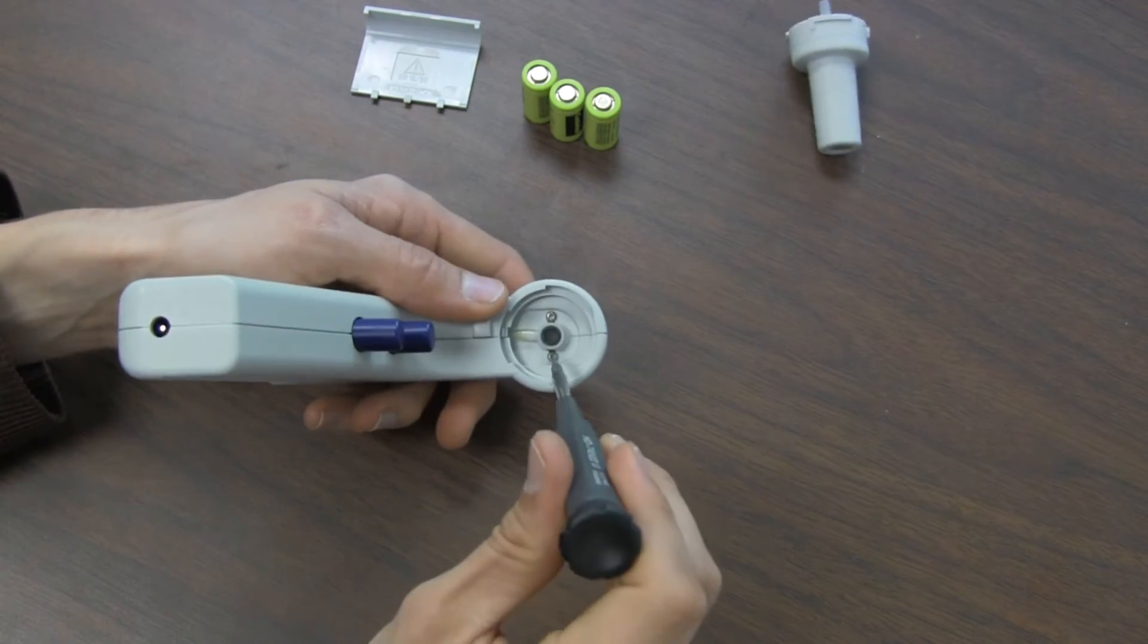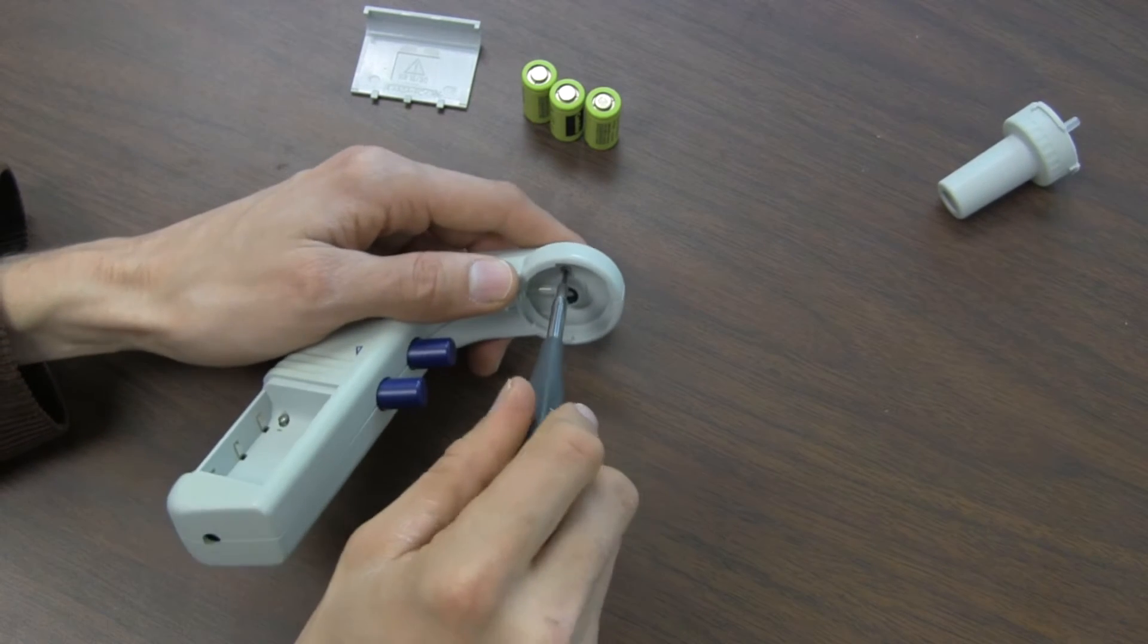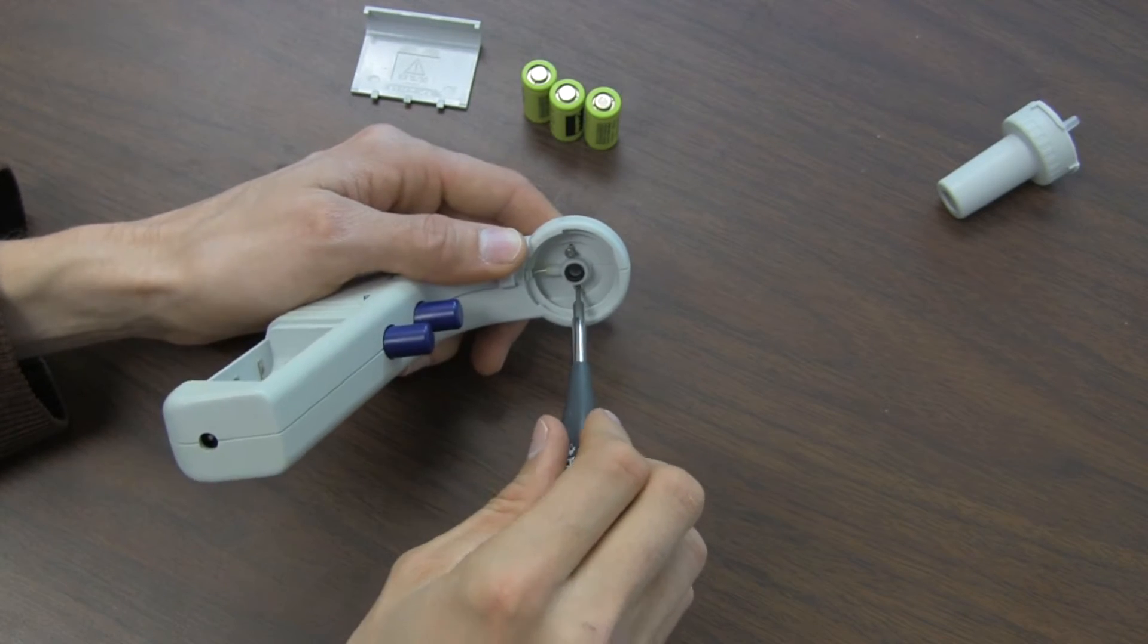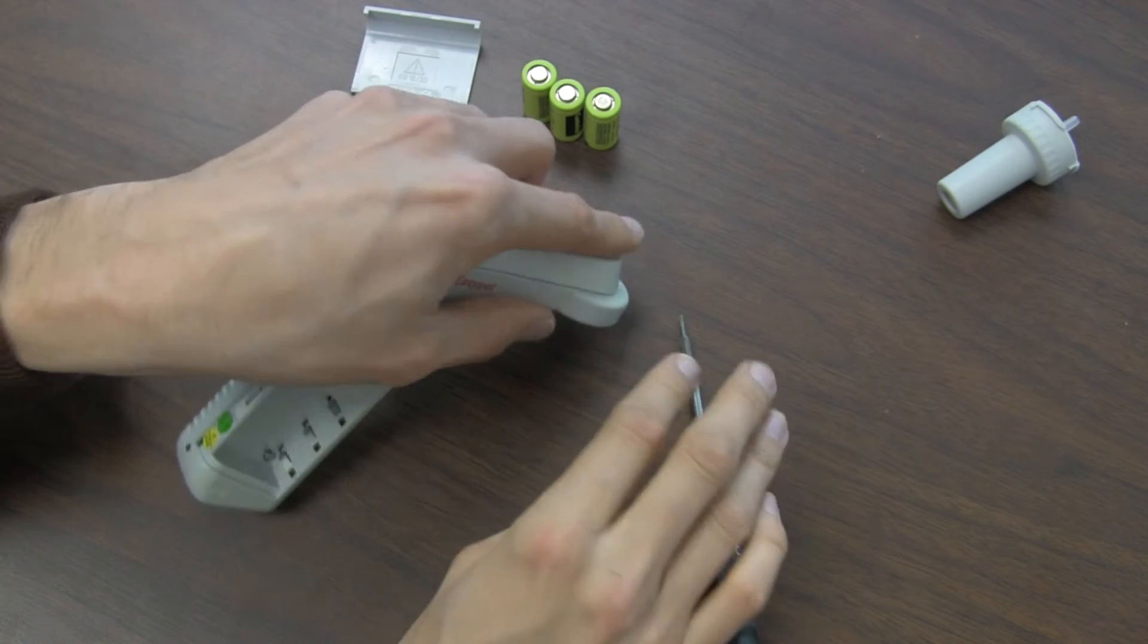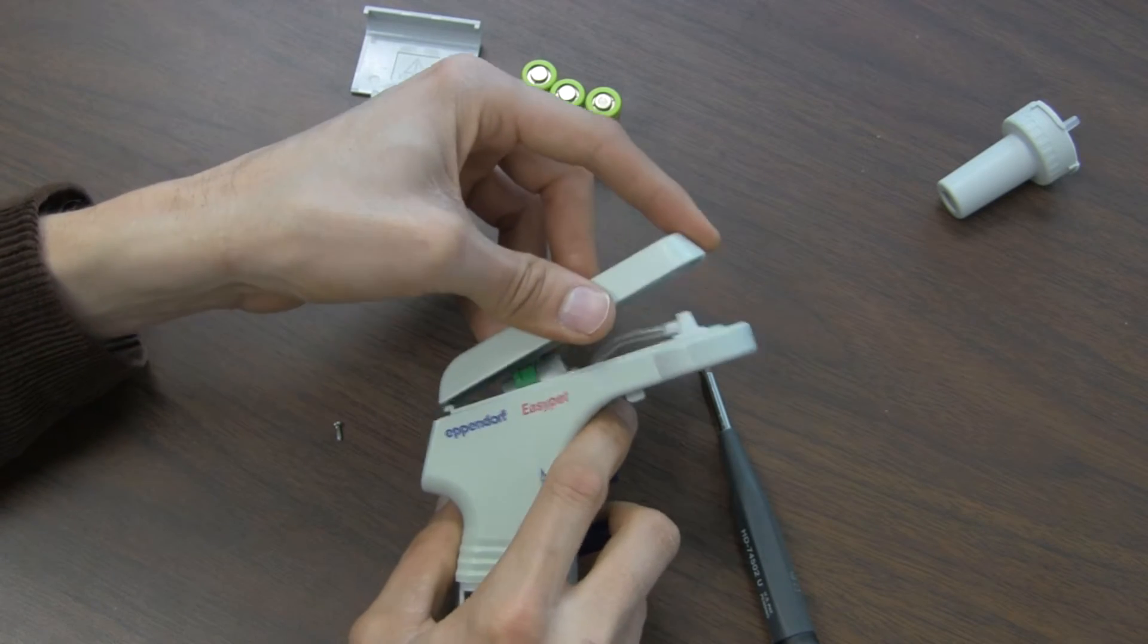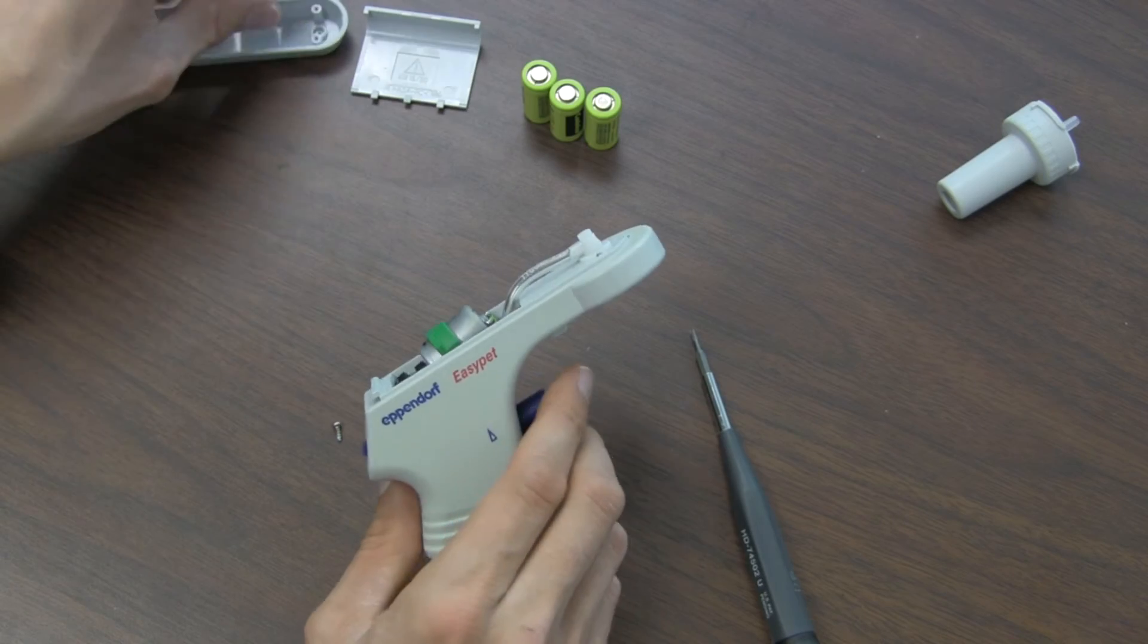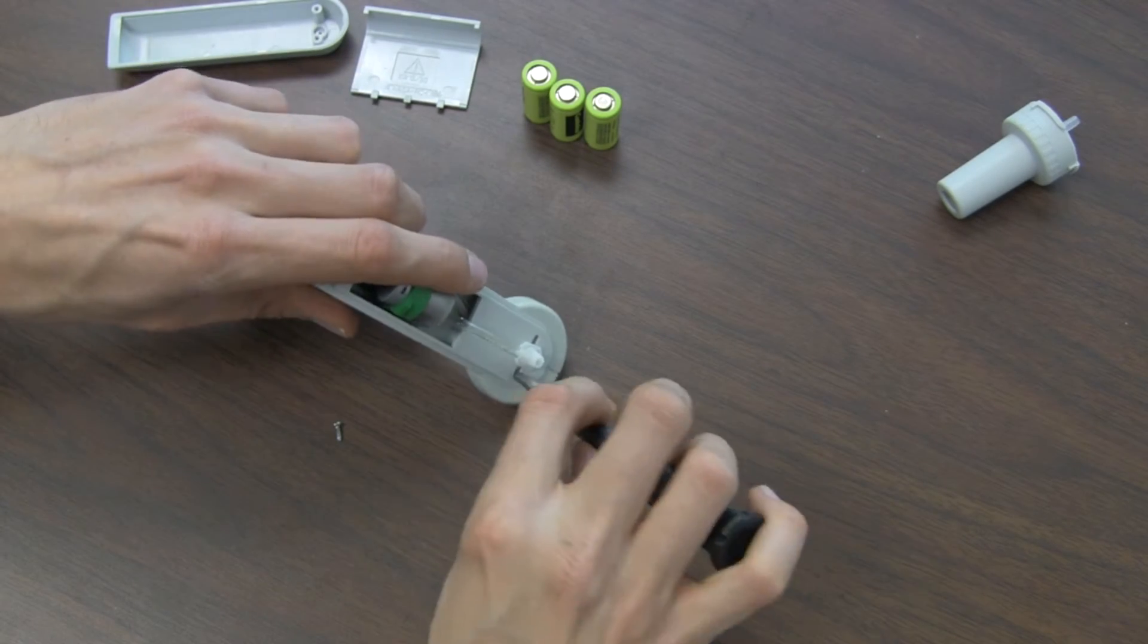And then you'll find there's two more screws in here that need to be undone. Same size, Torx T6. Then you can lift the top up and pull back. So the motion was lift up and then pull back to remove this top. And remove the screw.